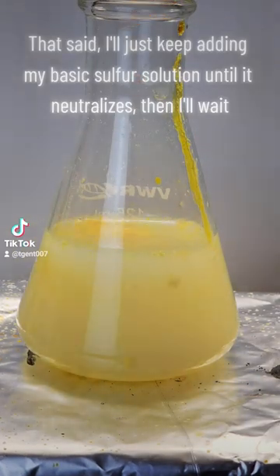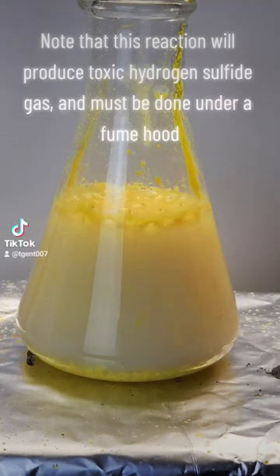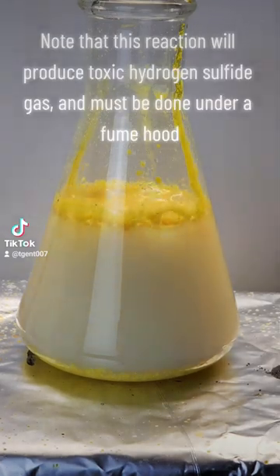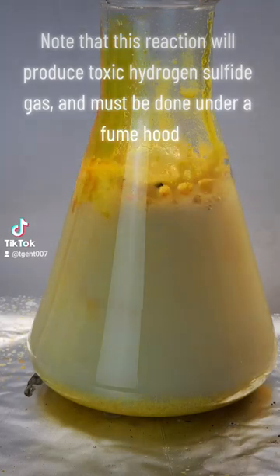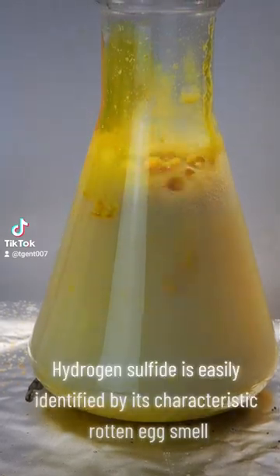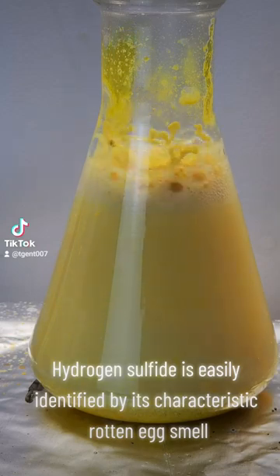That said, I'll just keep adding my basic sulfur solution until it neutralizes, then I'll wait. Note that this reaction will produce toxic hydrogen sulfide gas and must be done under a fume hood. Hydrogen sulfide is easily identified by its characteristic rotten egg smell.